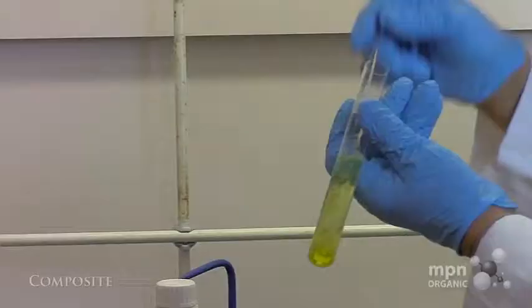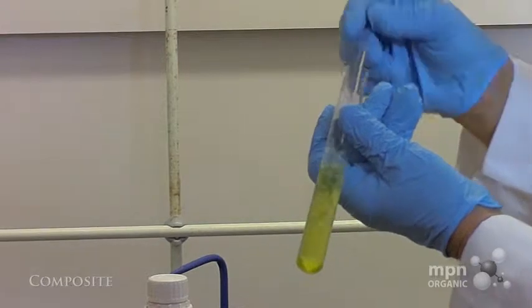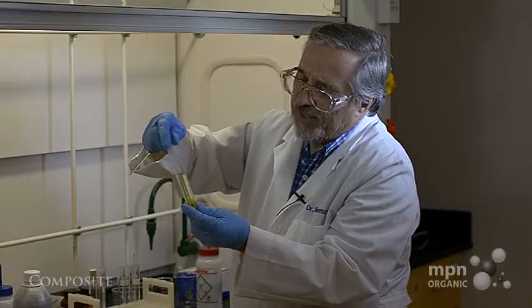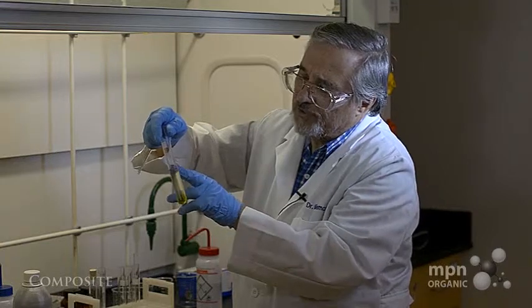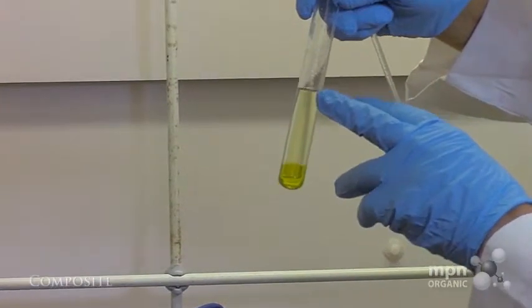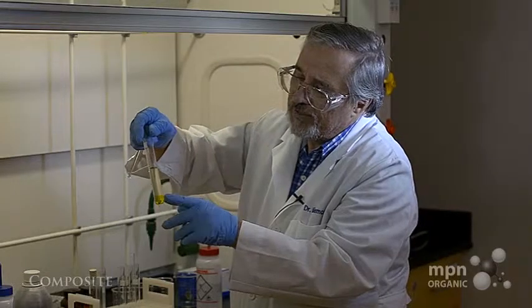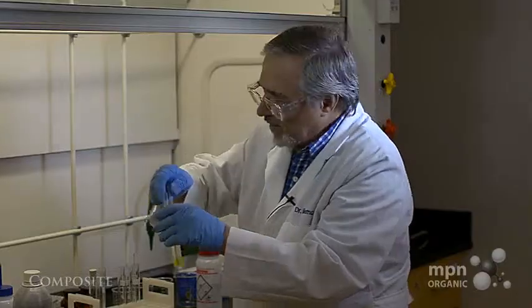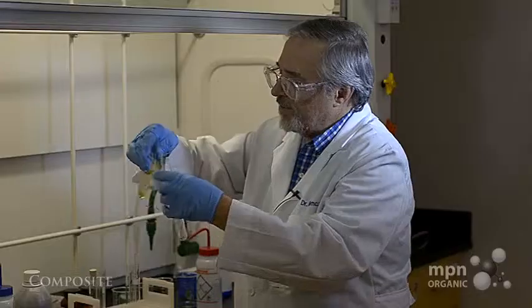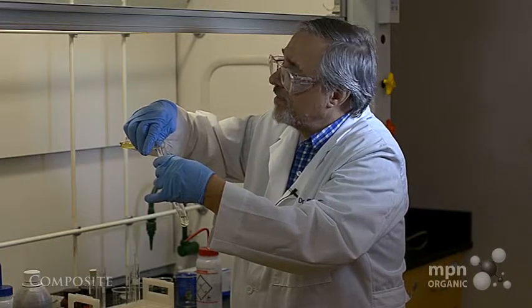Remember, water is not very soluble in diethyl ether, so I can use the diethyl ether to extract out the organic stuff, and the water is going to then effectively wash out any water-soluble stuff that somehow got entrained in the diethyl ether. Okay, so there's our water. Let's just pour this into another container. We're going to do this a couple of times.